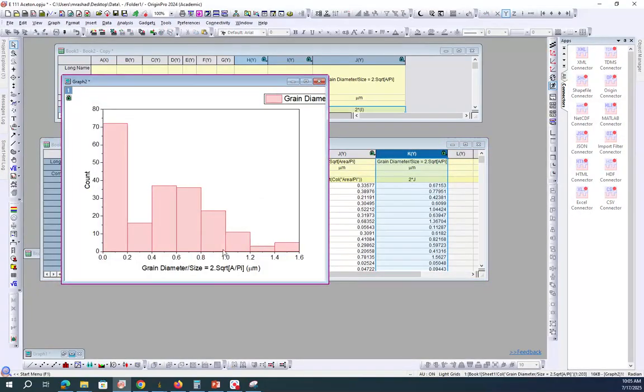Histogram. Yeah. So most of the grains here, let's choose grain size in micro. For micro, you can click alpha, beta, and press M, and then uncheck this, and again press M to write the micrometer.